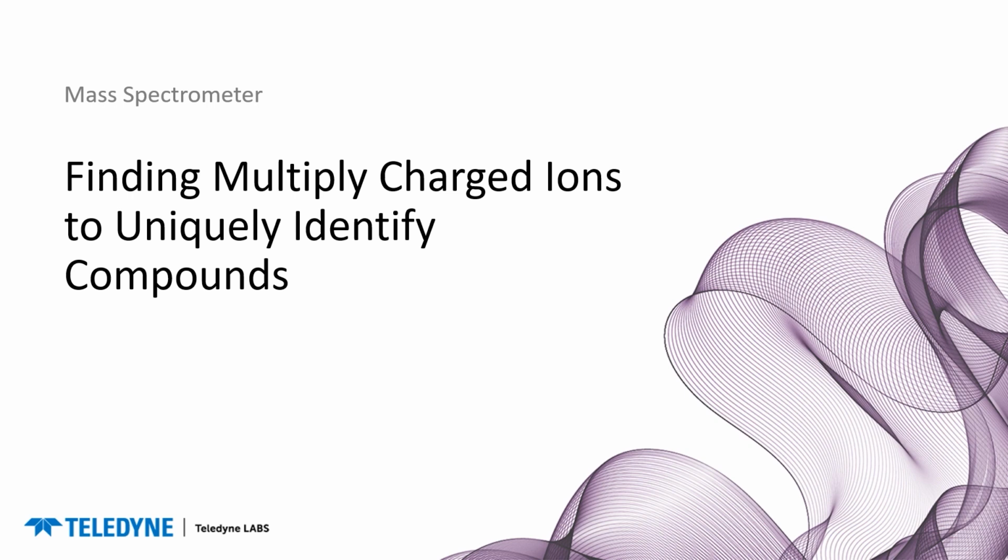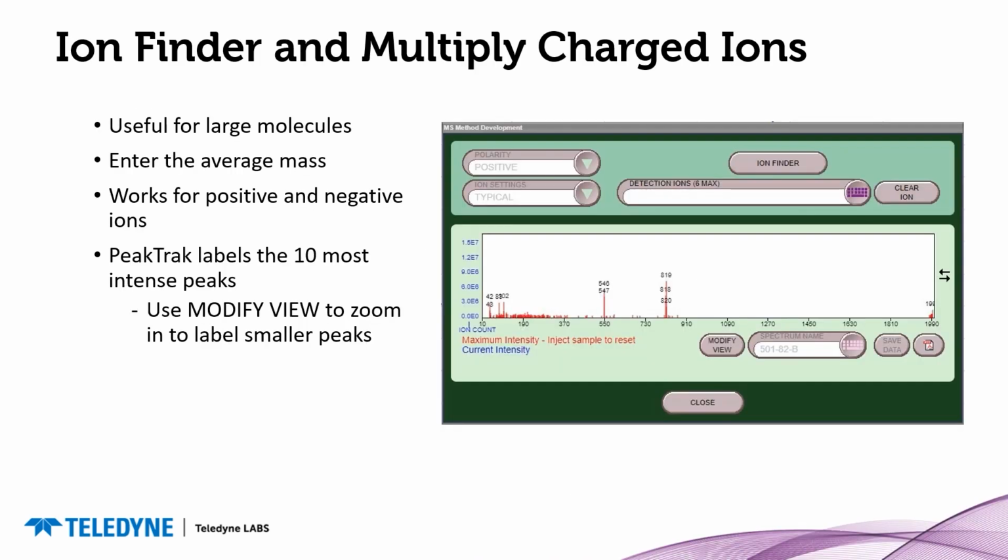The ion finder now makes it easier to see multiply charged ions. Many biomolecules have a mass technically larger than the PurIon can directly detect. However, these compounds are generally multiply charged, so their mass-to-charge ratio folds into the range of our mass spectrometers. Some large molecules may not show a molecular ion peak, as in the example above, which has a molecular weight of 1,635 Daltons, so the multiply charged ions are the only detection available.